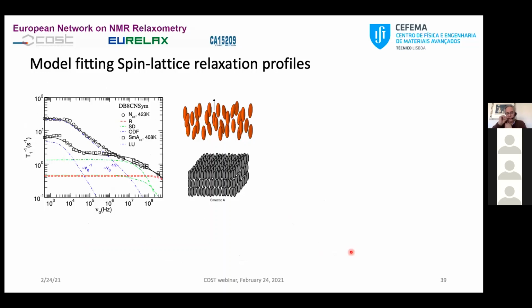And now comes the question of Danuta at the end of last year. In fact, when I made these measurements in 1988, there was something peculiar in this low frequency part. Please look here, we have 1 kilohertz here. At that time, in Frederick Nowak's laboratory, the machines were very well tuned, very well adjusted, and it was possible to make measurements down to 100 hertz.